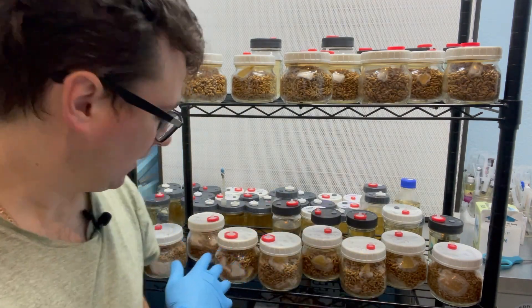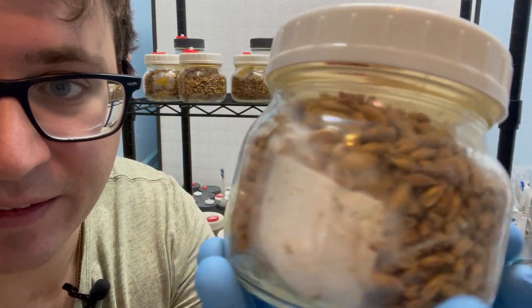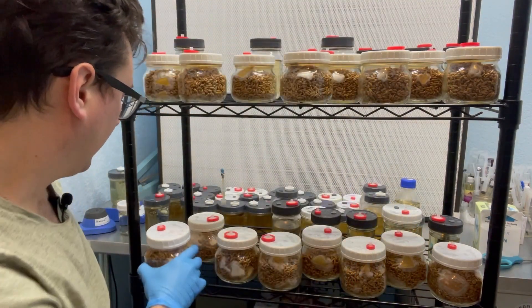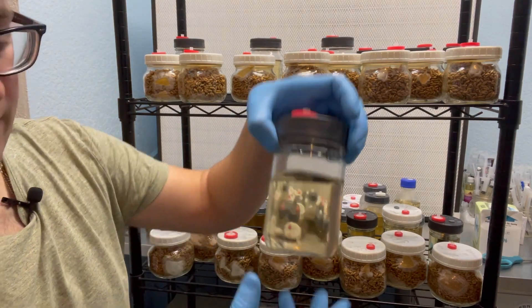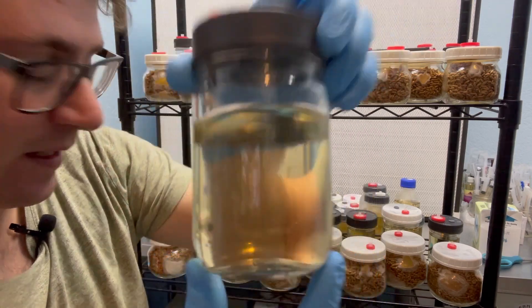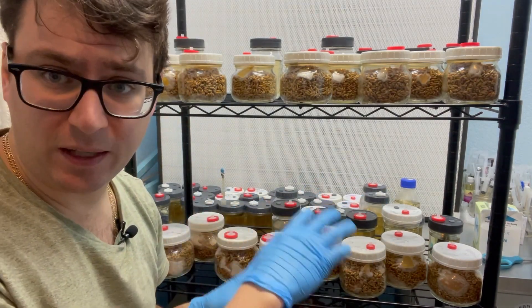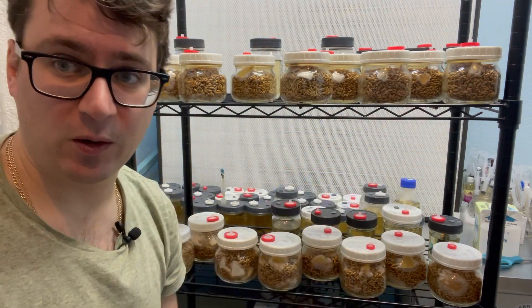Got some really nice mycelium that's jumping off. This is our Colorado summer oyster and it's looking really healthy on these oats. I've also got the liquid cultures and all of these are looking clean, growing pretty healthy. I'll just flip the camera around, do a brief overview, and then I'll update you guys whenever we get some fully colonized grain spawn, and then it will be going on to fruiting after that.